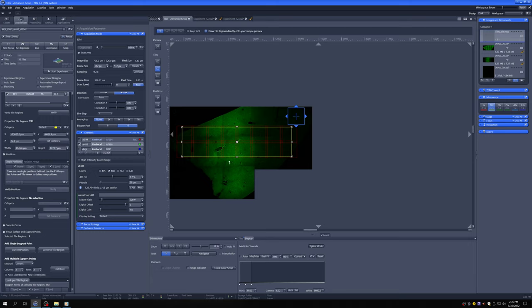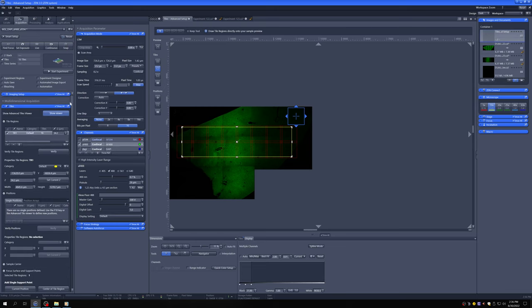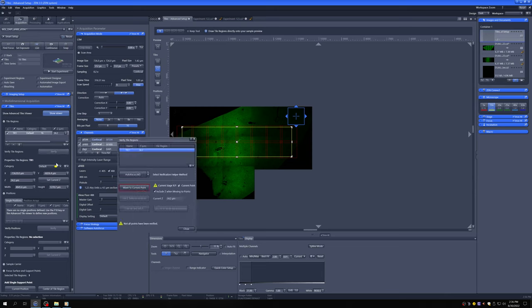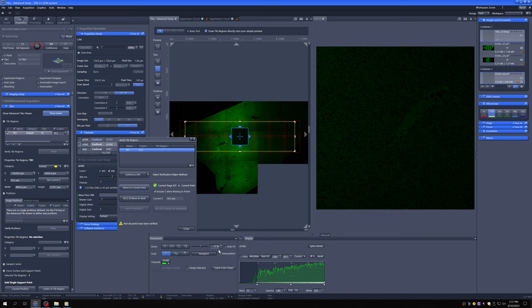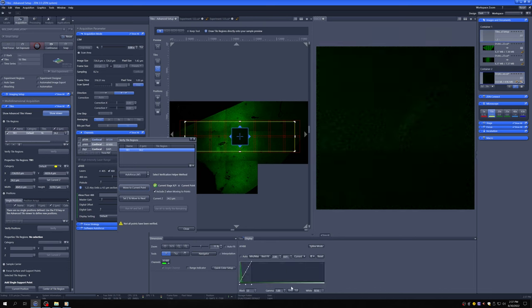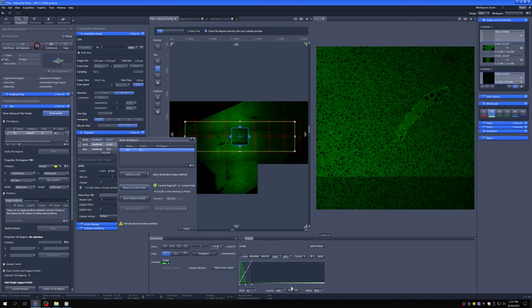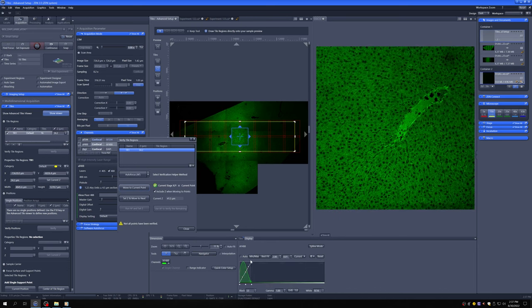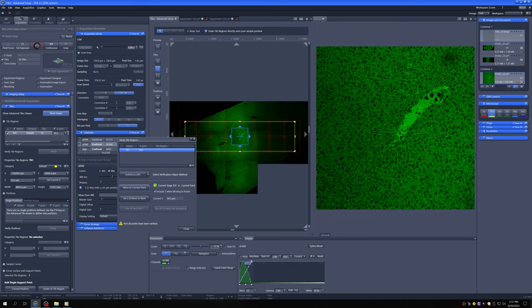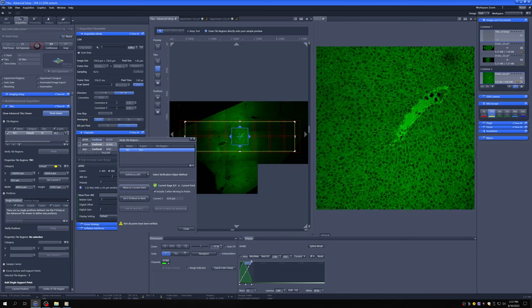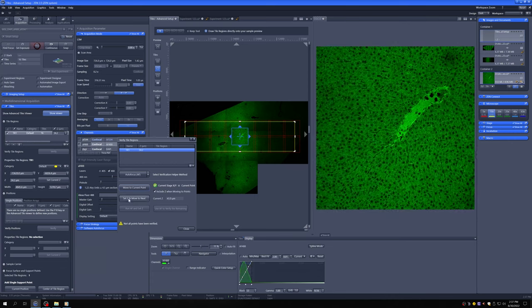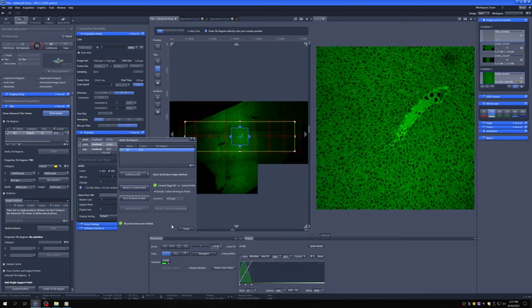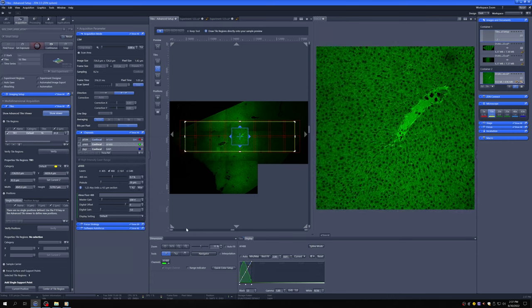First, I'm going to show you what happens if we don't do the support points, what's going to happen. So if I go to verify, just to make sure that I'm in focus, I'm going to move to the current point. So that's the center of the tile stack of the tiled region. I'm going to go to live. I'm going to make sure that that is as in the center as I can get it. So that's nicely in focus there.